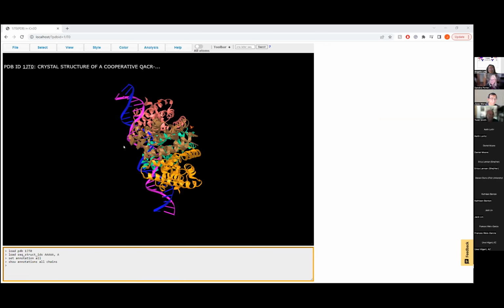Okay, cool. So hi, my name is Jack, and I'm a recent graduate from University of Washington, Tacoma, and I've been working a few months on iCn3D, just some small aspects in it. And one of the things I've been currently working on is creating a legend for all the different colors for iCn3D. So on my screen, you see a web version of iCn3D, and I've loaded in a PDB ID of 1JT0.